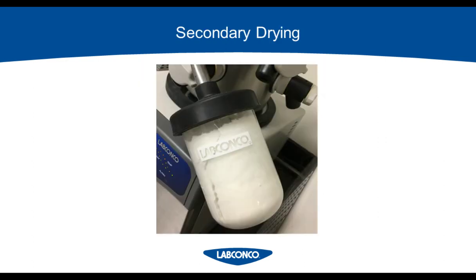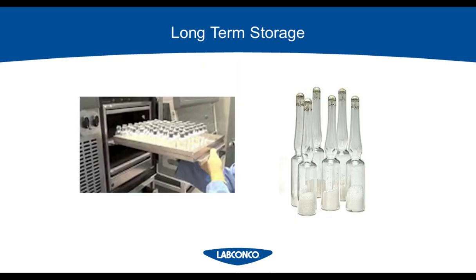After primary drying is complete, you move into secondary drying, where you are releasing the remaining water molecules that are bound to the sample. In order to complete secondary drying, you need a freeze dryer that has shelves so you can supply additional heat to your samples and get the moisture content down to about 2%.